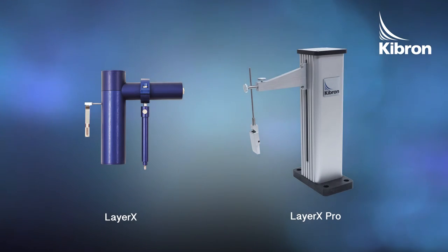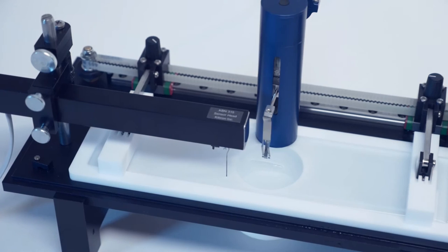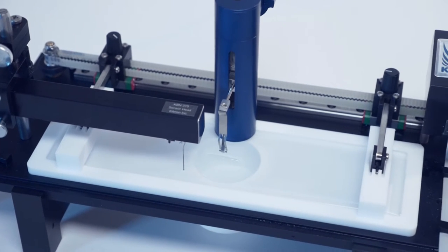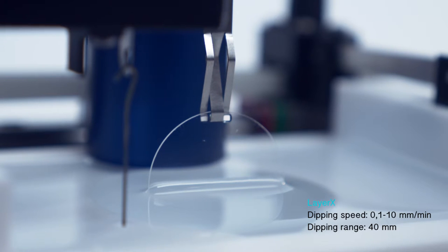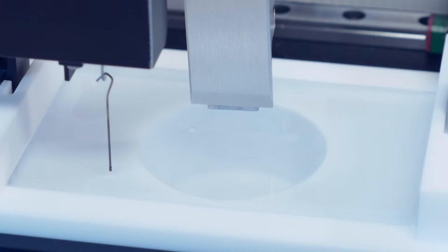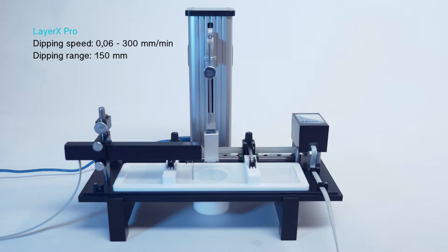Using a dip coater, the substrate is dipped in and pulled out of the solution to coat the substrate with a thin layer of molecules. Kibron dip coaters are available as software-controlled version or version with hand control unit.